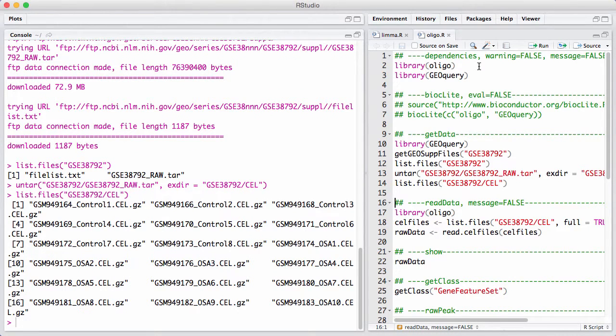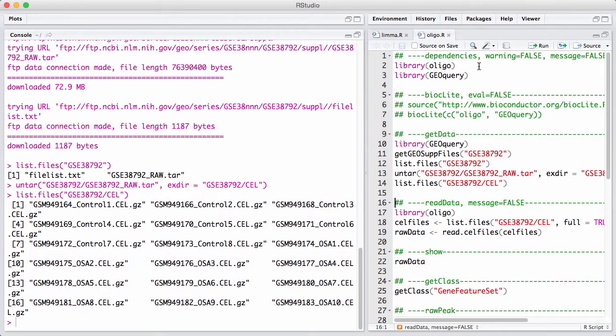We can see that the file names are actually very informative. They have some GSM sample IDs, and then they have underscore what we're actually interested in, which is the variable of interest. This experiment was comparing samples from some control patients to patients with sleep apnea. We can see we have the control samples 1 to 8, and then we have the treatment samples that are labeled as OSA from 1 to 10.